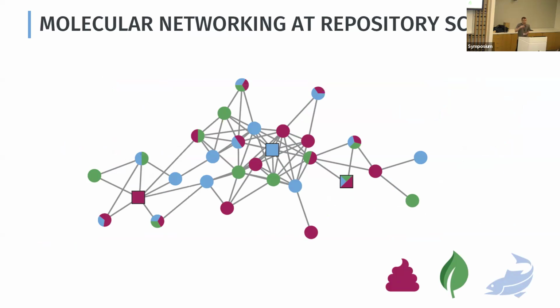And this is actually a crucial aspect of this work because now you can find these patterns across data sets. For example, a metabolite that might be present in plants or animals that are consumed as foods. You would have the original metabolite in your original organism, but then you might have a metabolized version of it within humans after it has been consumed.